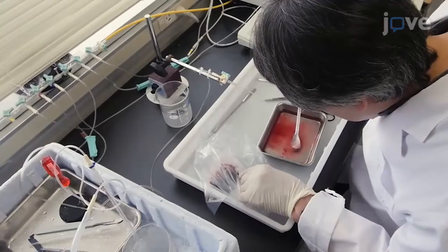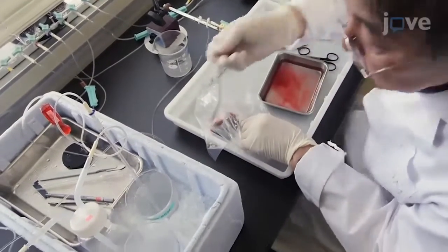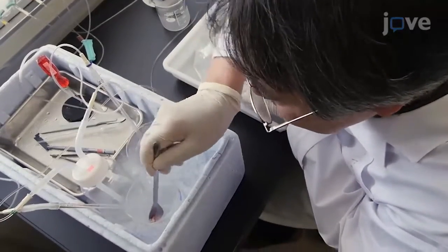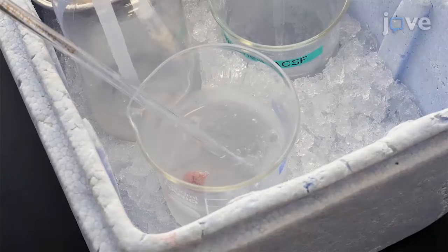To begin this procedure, immerse the decapitated head in ice-cold ACSF in a stainless steel surgical tray. Extract the brain within 1 minute and place it in a beaker containing chilled ACSF for 5 minutes.